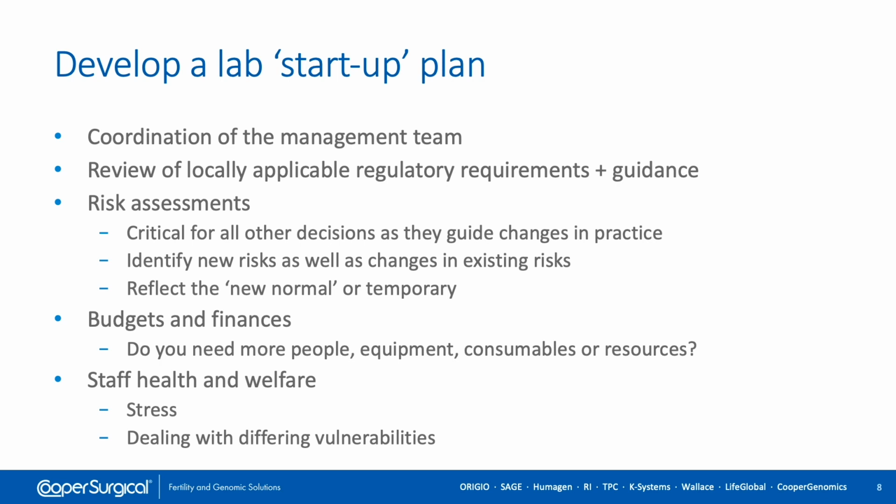Establish a small working group to coordinate efforts and keep abreast of the rapidly updated relevant information, including mandatory requirements relevant to your unit. The need for changes in policy and procedure will be defined by your risk assessments. These will determine what and where changes are required and what changes will mitigate any identified risks. It may also be necessary to consider whether these changes will be temporary, for example, to address the current pandemic, or indeed will become the new accepted standard for good laboratory practice.